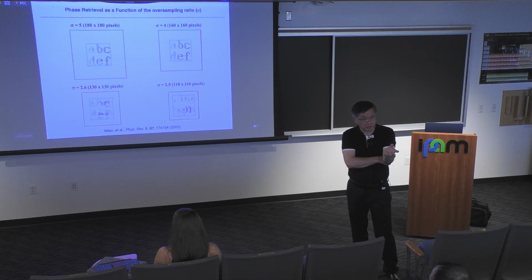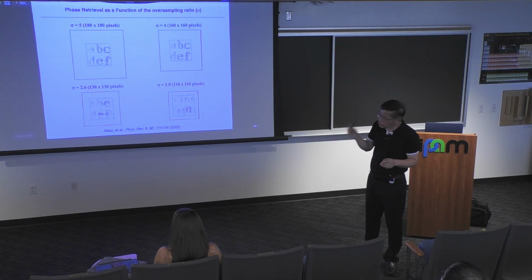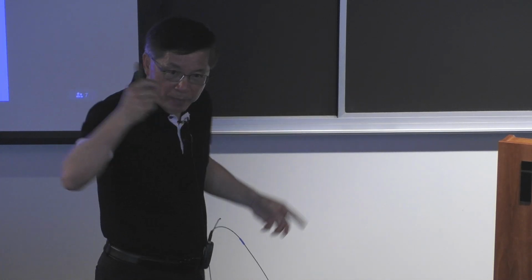So the direct method is actually very interesting. In crystallography you only sample at Bragg peaks. But in this case, you have to measure intensity between the Bragg peaks. When it's a crystal, the intensity between Bragg peaks is very, very weak. But if it's a non-crystal, the intensity is more continuous, just like I showed, and there are still speckle patterns. You can measure it finer.